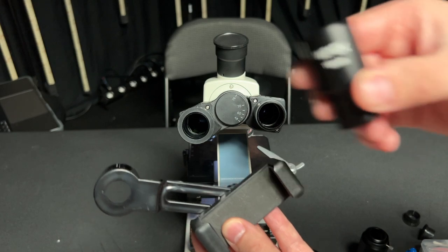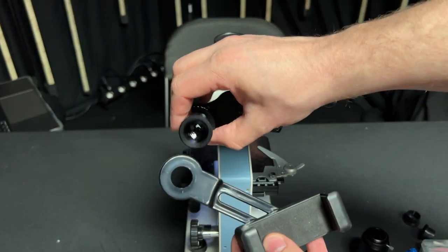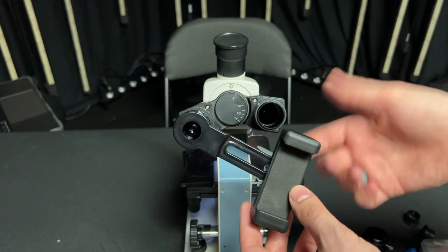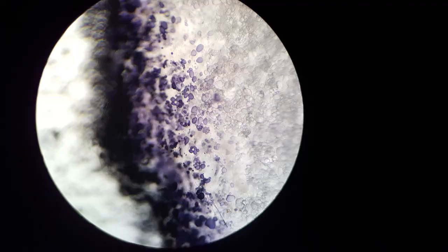Now if you want to use the included phone mount we're going to take this guy put it on here, slide the phone mount on and then we can attach and tighten our phone and I've included a photo here to give you an idea of what that might look like.